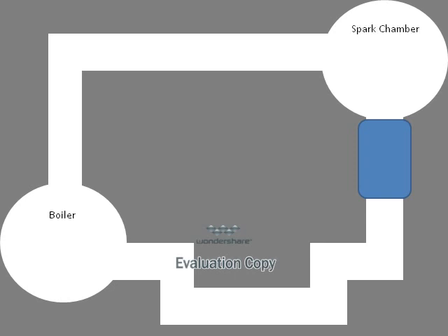We obtained a boiler, a spark chamber, a condensing column, and a collection trap.